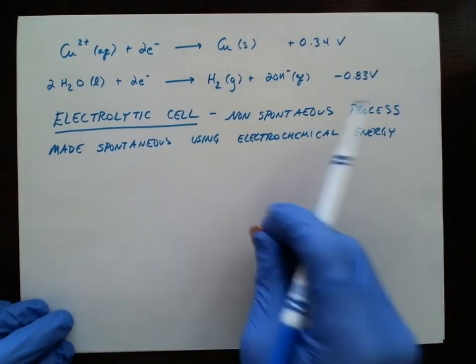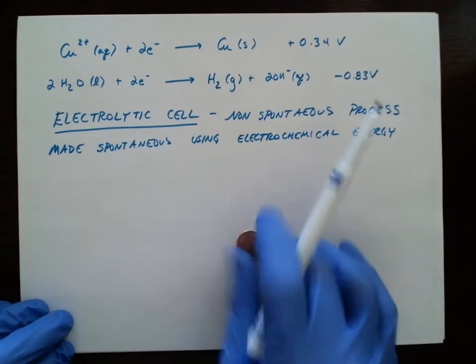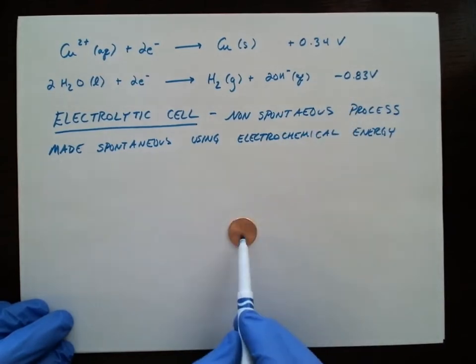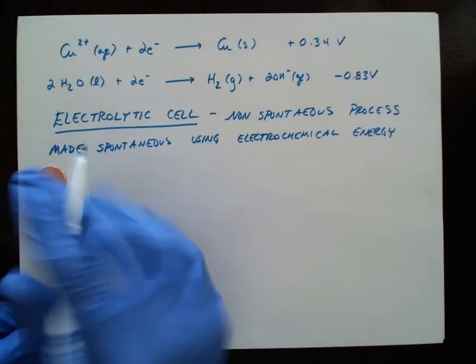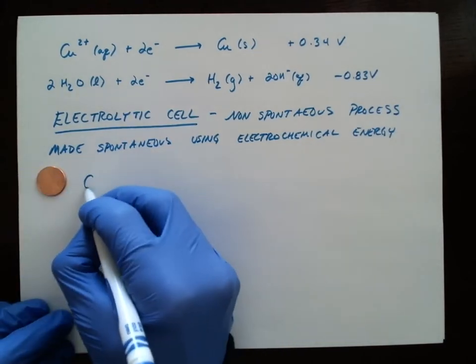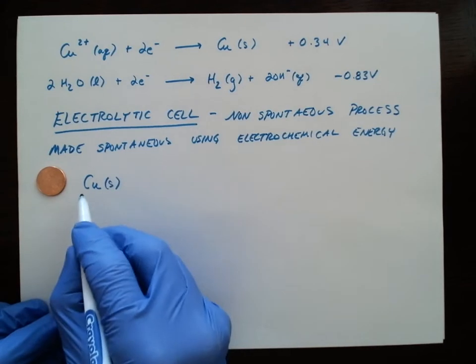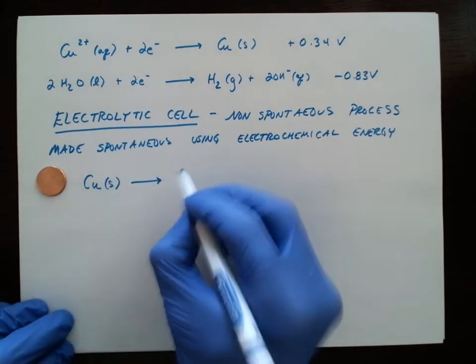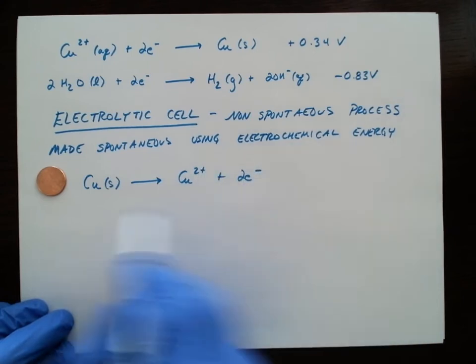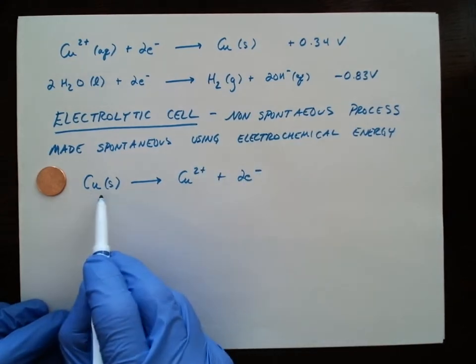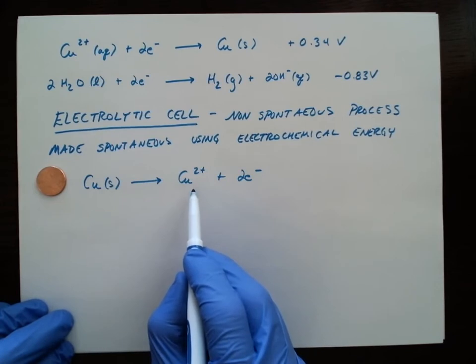I'm going to do this using an experiment you've seen and done before. I'm going to try to generate some copper 2 ions on the surface of this copper penny. So I want to see solid copper on the surface of this penny oxidize. I want to pull electrons from the solid copper to make copper 2 ions.